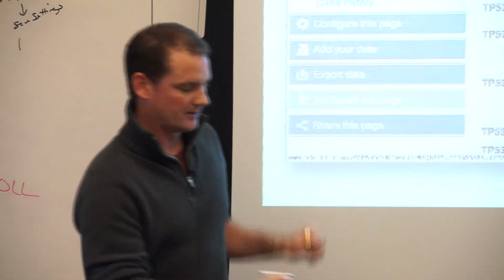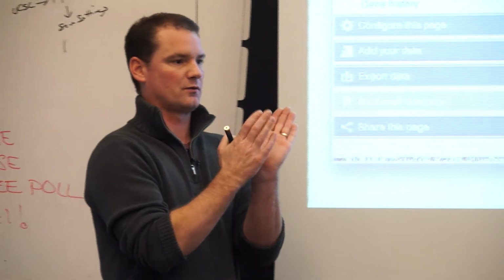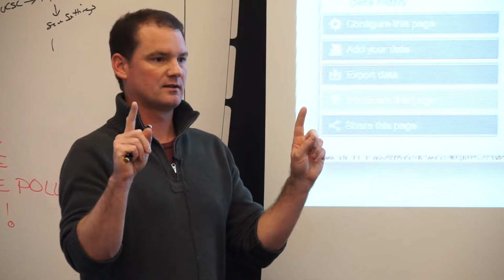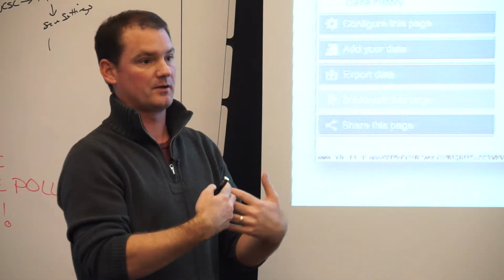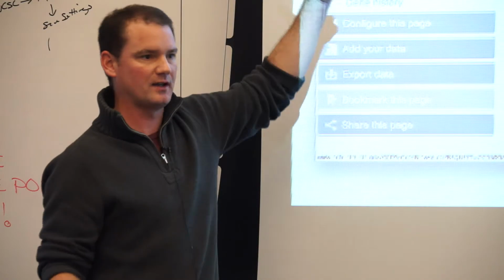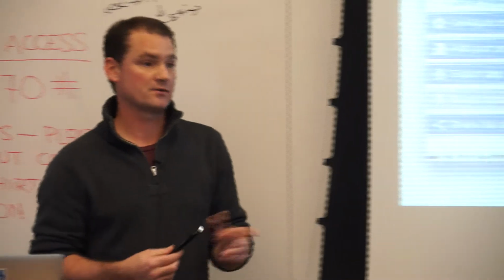So I guess I probably didn't explain it well enough, but principal isoforms are really just used for, if you wanted to compare the predictions of two tools, you could just choose the principal isoform to feed into both of those tools and then compare the predictions among those, because some transcript sets have 50 isoforms, some only have 10 for the same gene. It's not just a union of all exons. That's right. Okay. That's right.